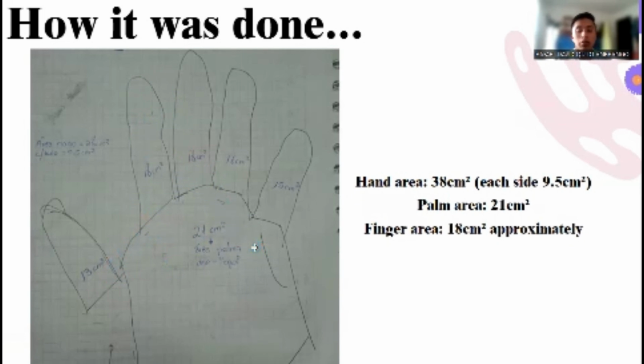We used this representation for the isolation.